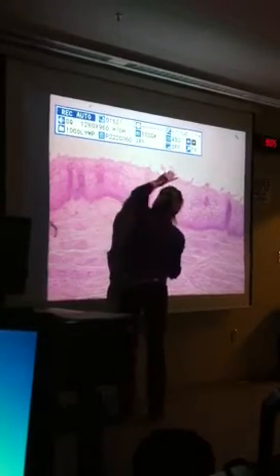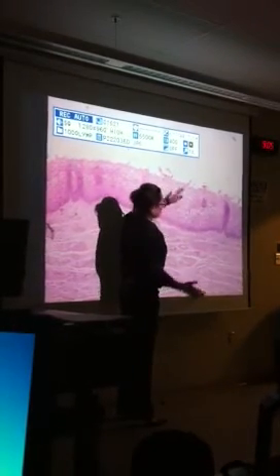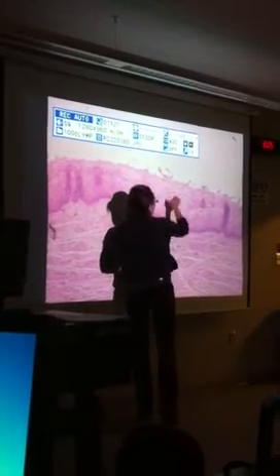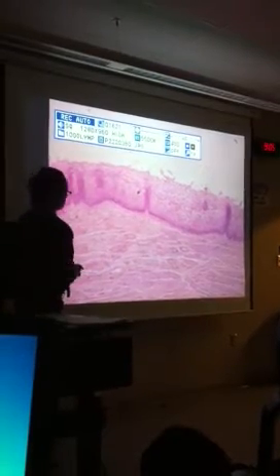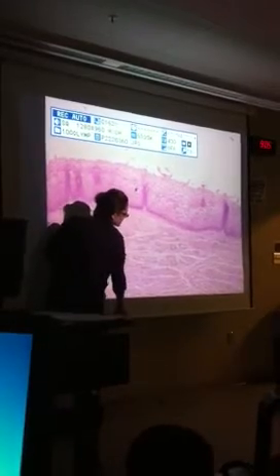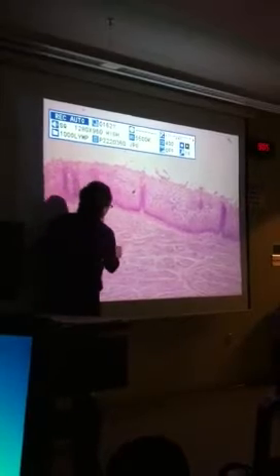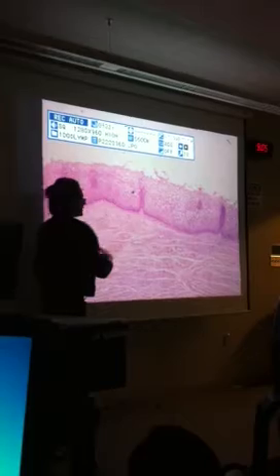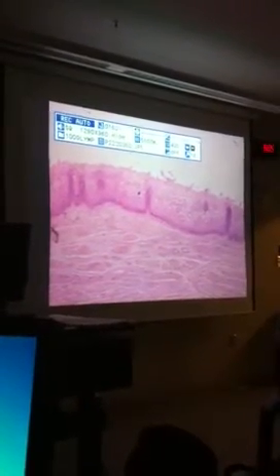And again, you should be able to see layers of cells stratified. The cells look like they're kind of squashed, squamish. These are really durable cells because the vagina has to deal with a lot of abrasion. When you go from this part down, this is the smooth muscle of the vagina, and then these little circles here, those are just glands that are releasing mucus. So those would just be rings of simple cuboidal epithelia.